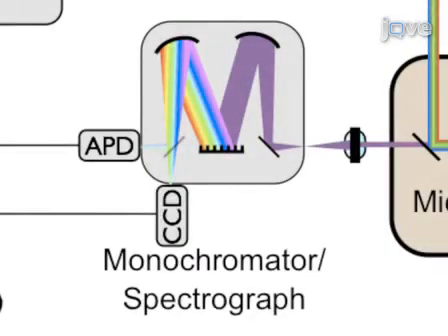An electronically actuated flip mirror within the spectrometer in the lowered position sends the signal to a back-illuminated deep depletion charge-coupled device or CCD camera, which provides spectroscopic information across the entire signal range and allows us to identify and optimize the various coherent Raman signals.